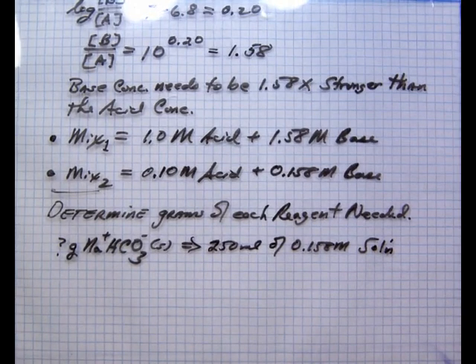Now you take each one separately as if you were just making that solution only, and figure how many grams of stuff you need.